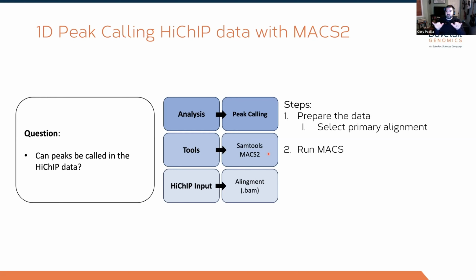The other thing to consider is that only a fraction of your reads will fall within the DNA protein binding site. Remember that only one part of the read pair maps to the anchor. The second part is someplace off in topology space. So you actually need quite a bit more data than you would with ChIP-seq data to call peaks. And so this has 2 ramifications. The first one being that you'll be calling both primary and secondary peaks if you only feed in HiChIP data.